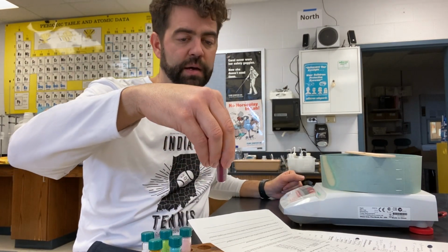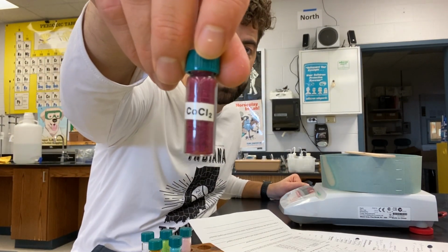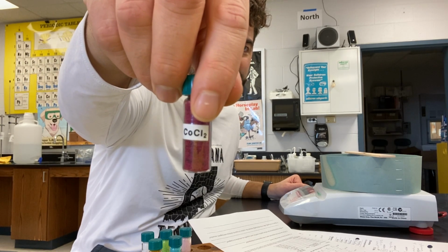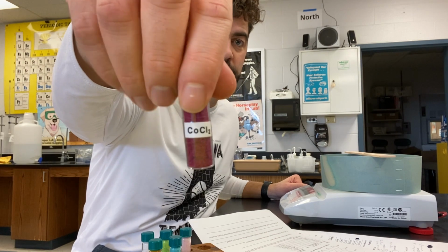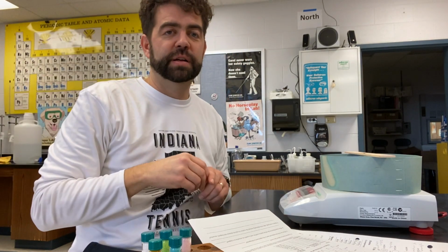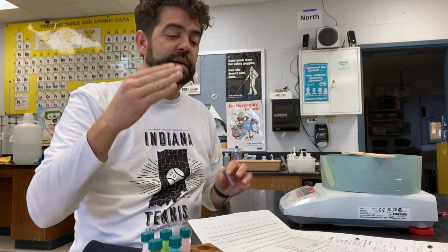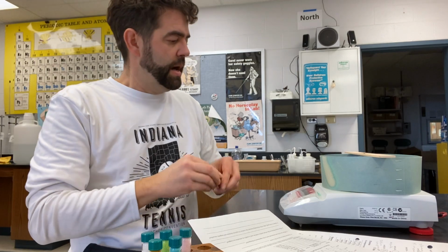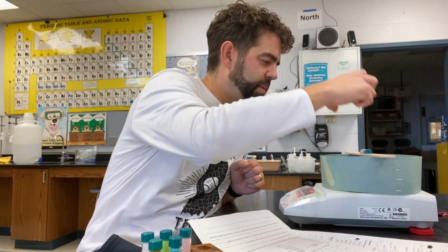I take the cobalt. Cobalt's a pretty cool color there, purple. And again, it's CoCl2. Now I don't care so much about the Cl2. What I care about is the cation that is formed when you lose electrons, specifically 2 electrons. And that's important, as you probably found out before. So I'm gonna put this right here, and I wanna see what my reading is.